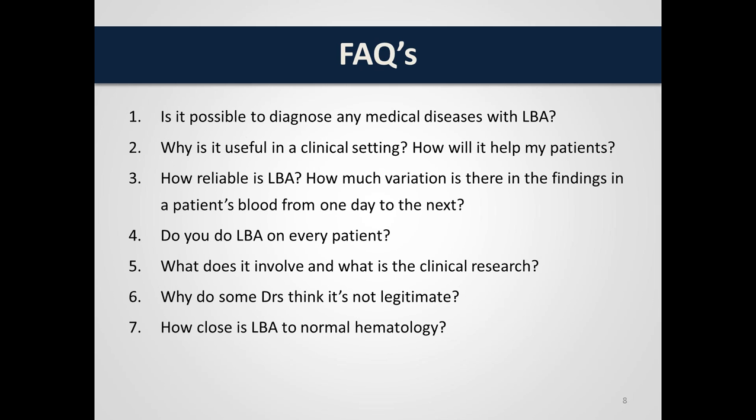He wrote a book, or a number of books actually, describing the value of evaluating blood in a living, unchanged and non-stained state. He argued that all hematology labs should change from analyzing stained blood samples to live samples, mainly because with live samples you're able to observe in real time the dynamic process of life at the cellular level. Now, he said that you can capture events and sequences that are impossible to see in static, dead, stained samples.